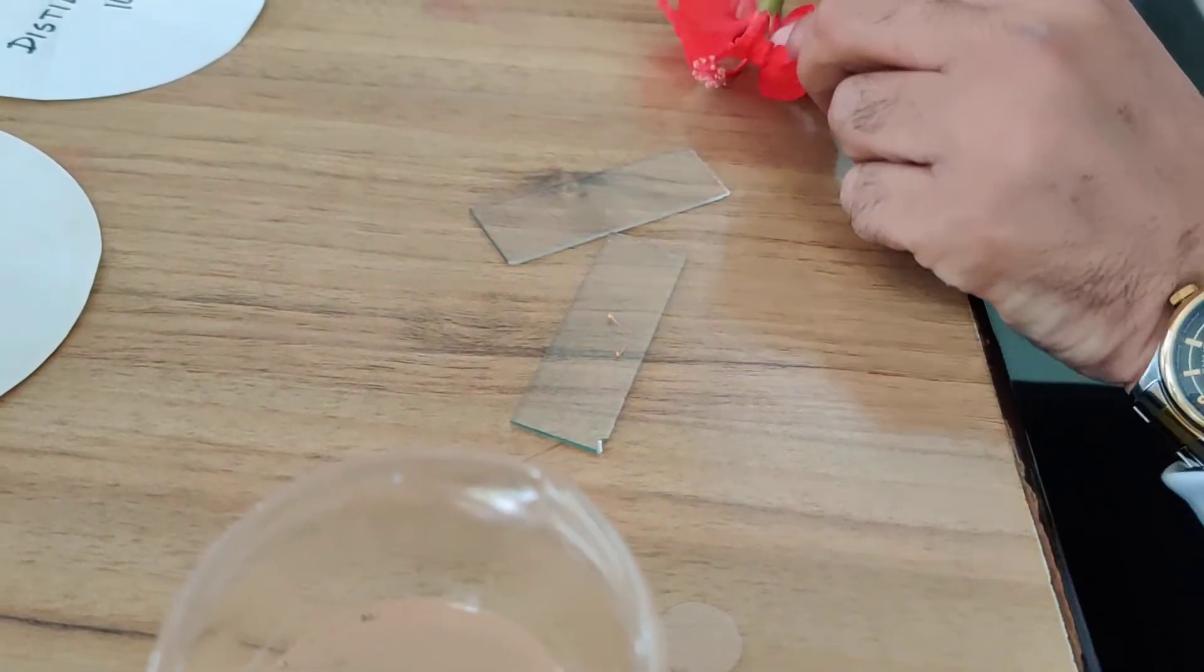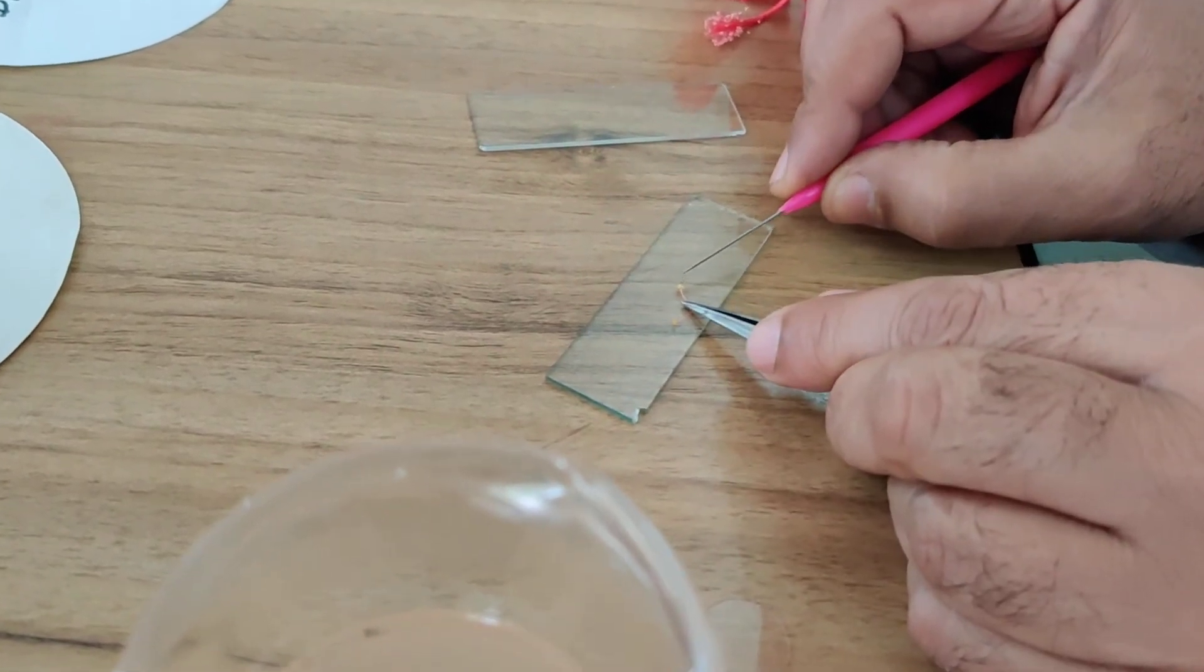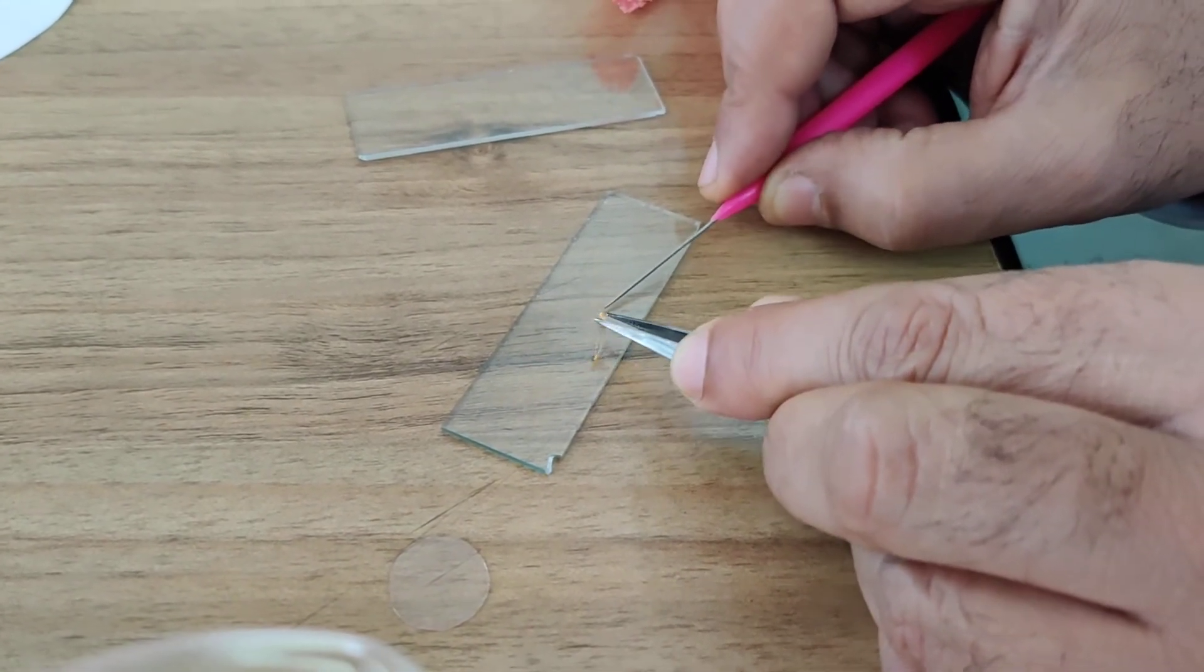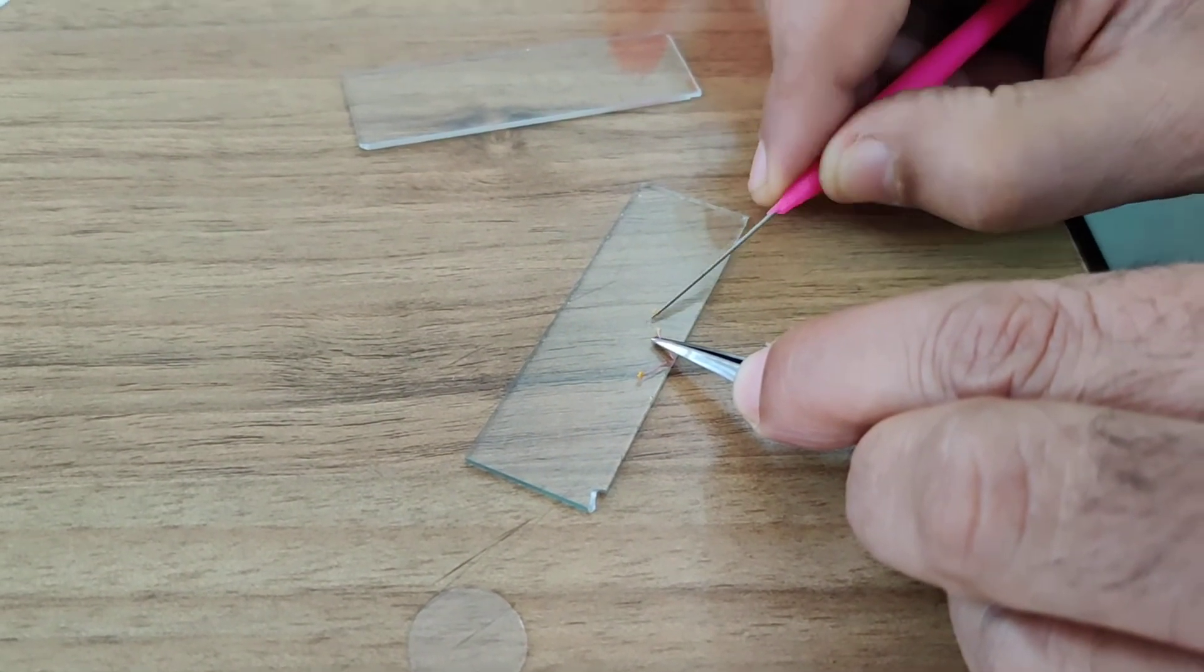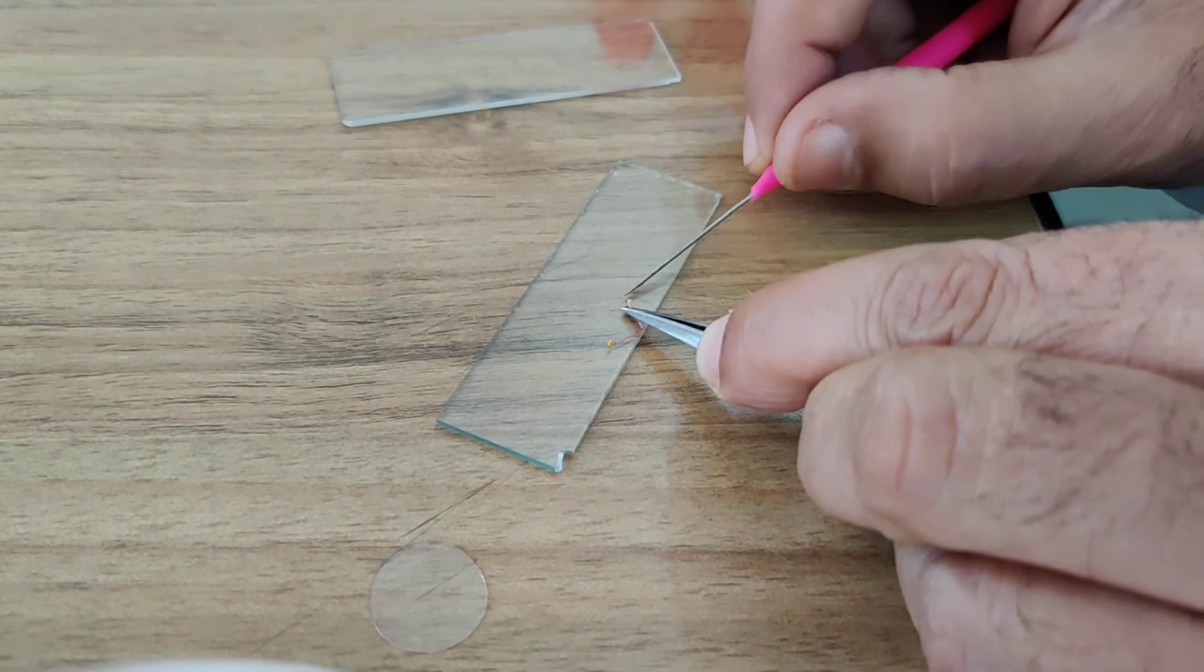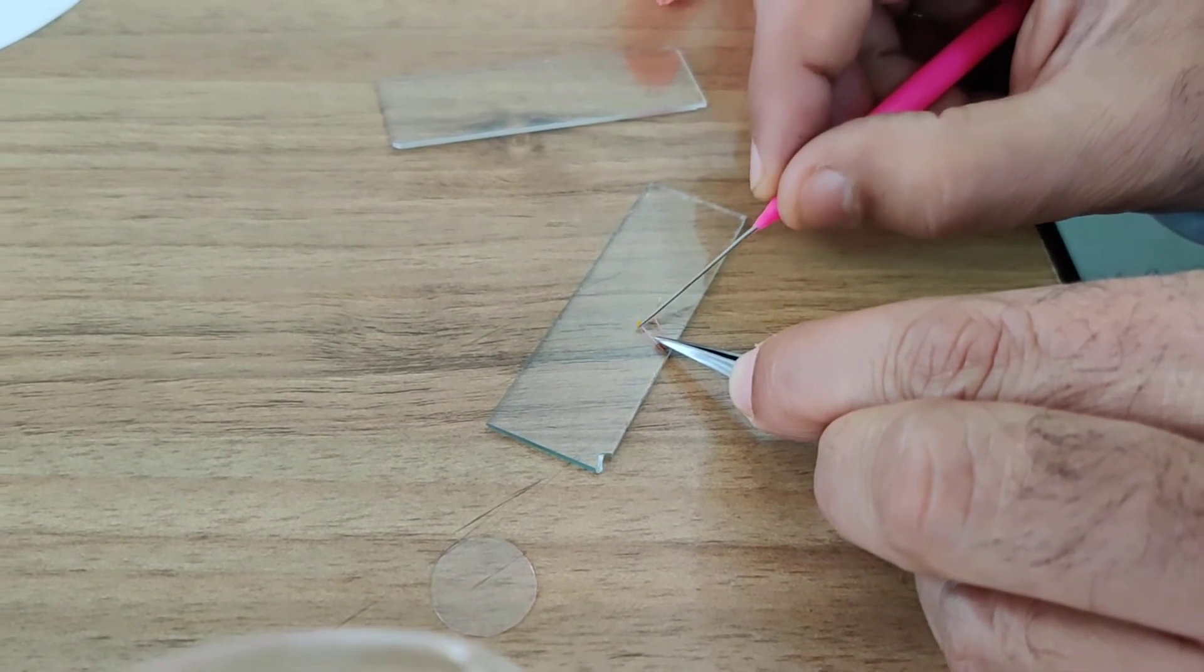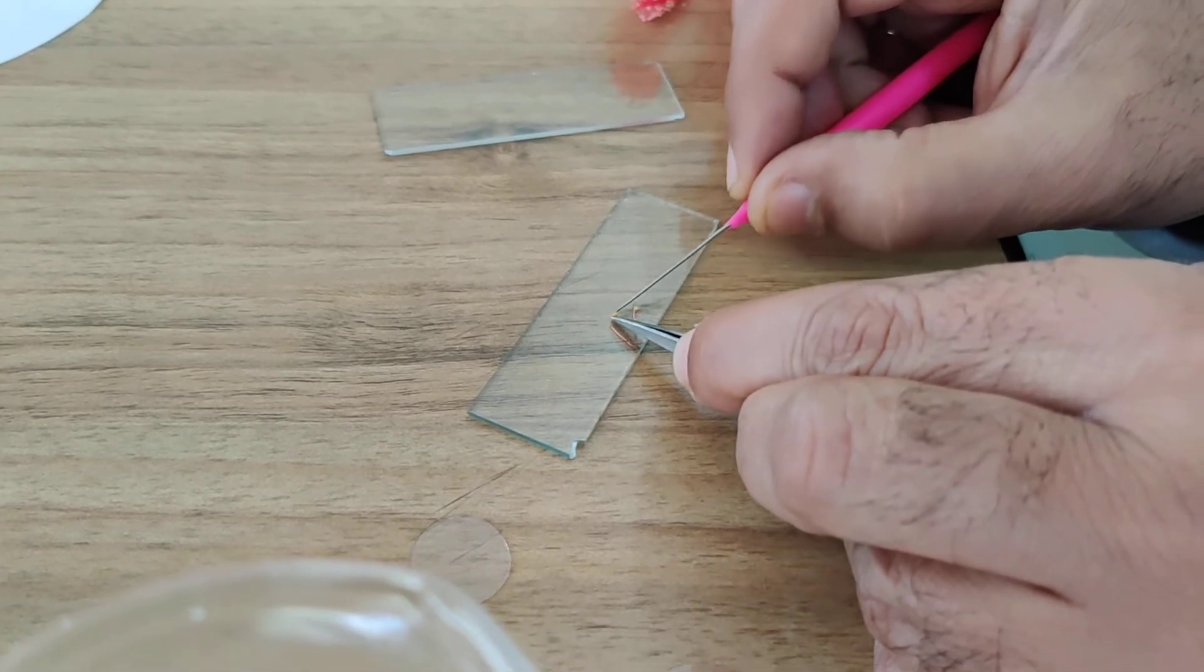From this anther we have to separate out the pollen grains very gently. The yellow dust of pollen grains is removed from this anther as well as from other anthers also.